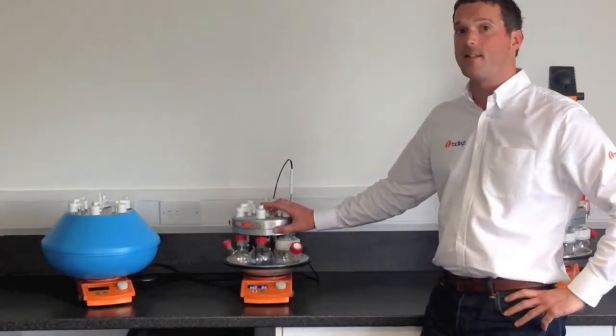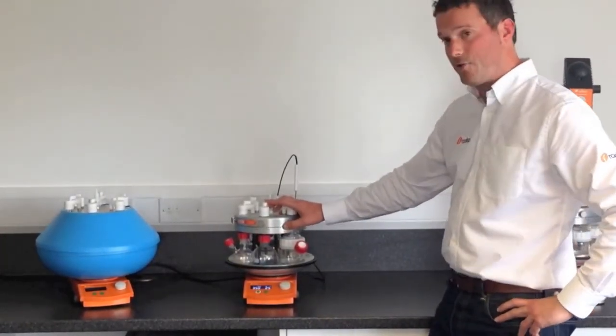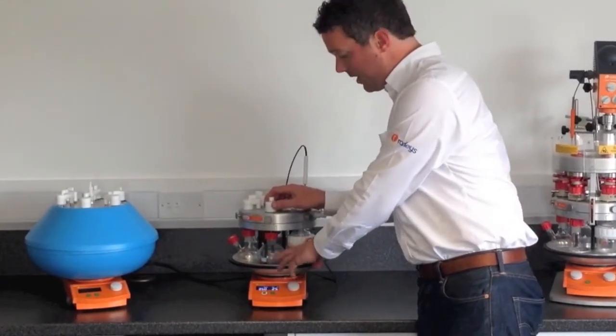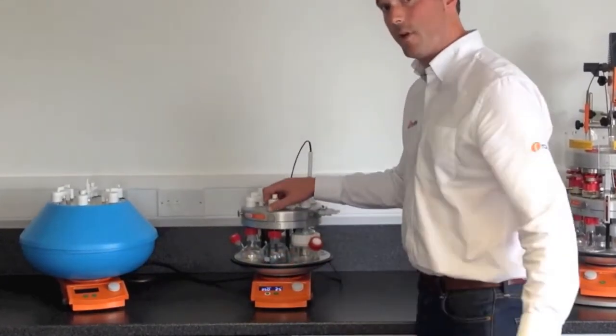Hi, I'm Ben from Radleys. I'd like to show you the Radleys Carousel 6 Plus. The carousel allows you to simultaneously heat, cool, and stir up to 6 samples under an inert atmosphere.